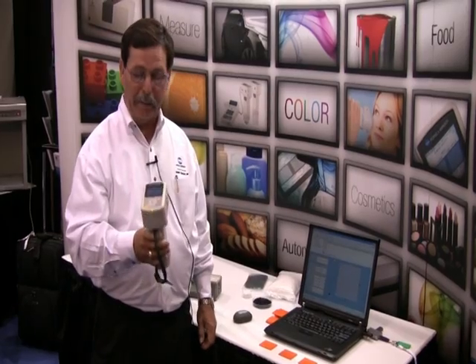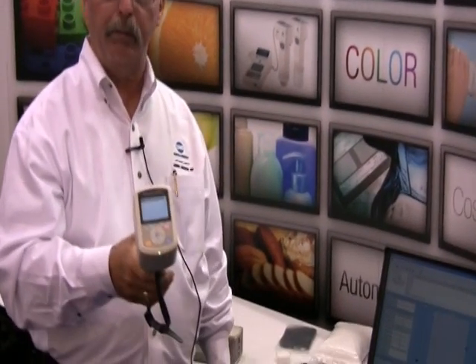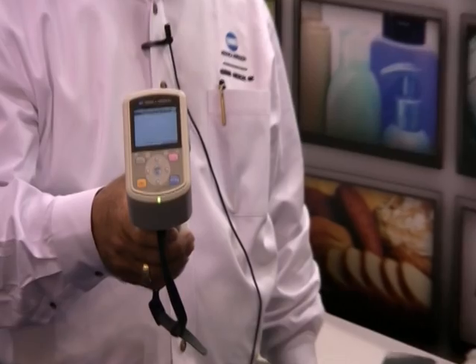Good morning. My name is Norm Demers. I'm a Senior Applications Engineer with Konica Minolta Sensing. Today we're going to demonstrate the new CM700 Portable Spectrometer, and what we're going to be showing you is a capability of communicating with the software via Bluetooth.